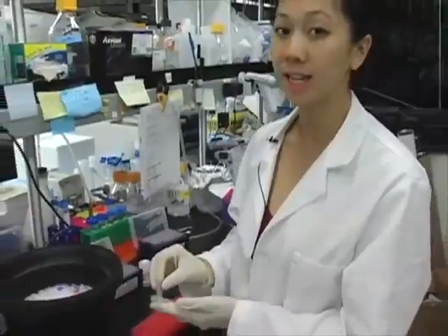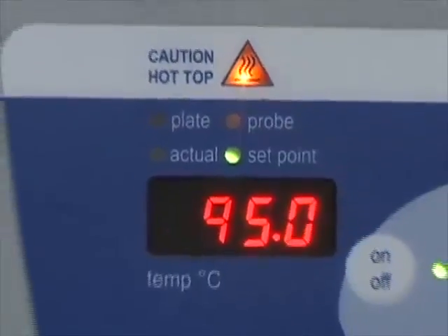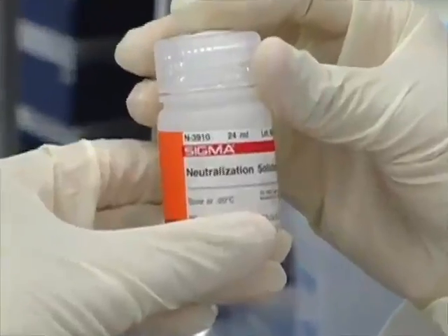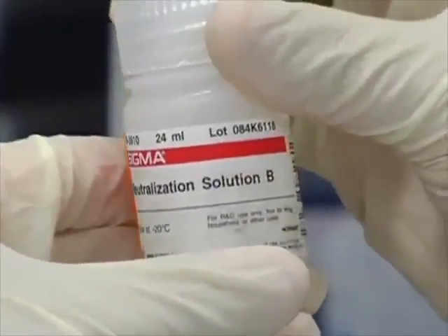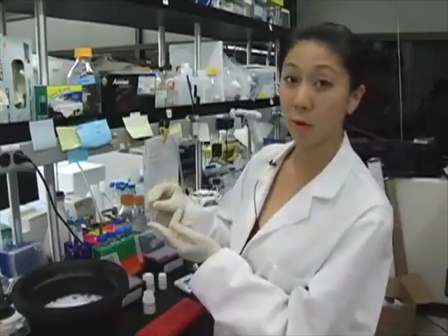Now that the 10-minute incubation is up, we're going to heat and inactivate the reaction at 95 degrees for 3 minutes. Our 3-minute inactivation is up, and now we're going to add the neutralization solution that's provided in the kit, 100 microliters per reaction. And you're going to mix this by vortexing.